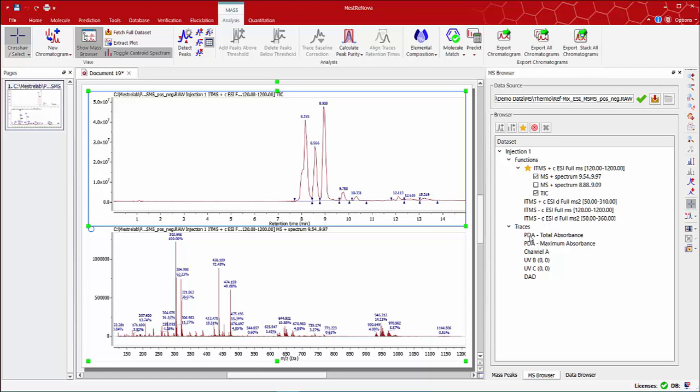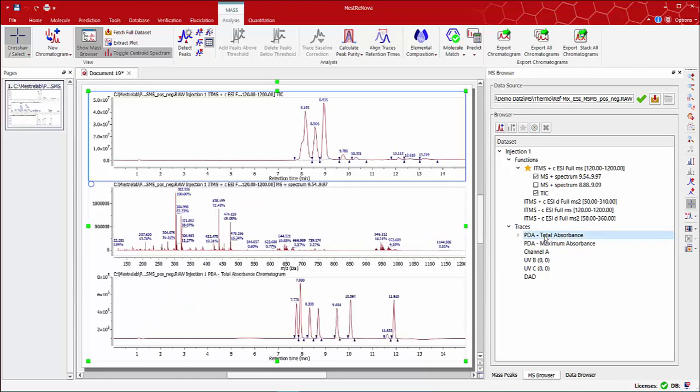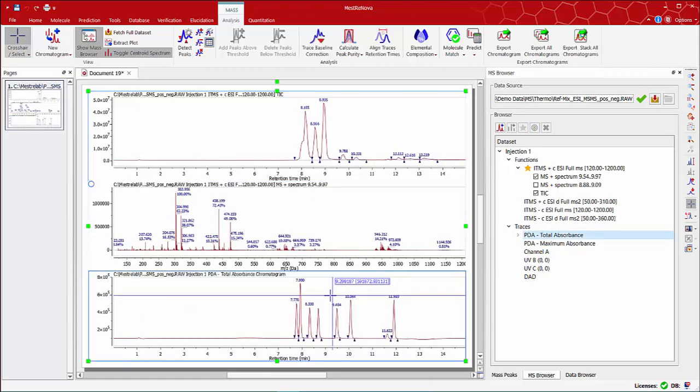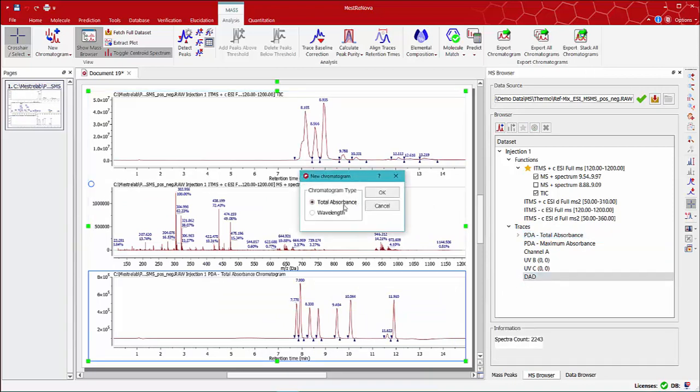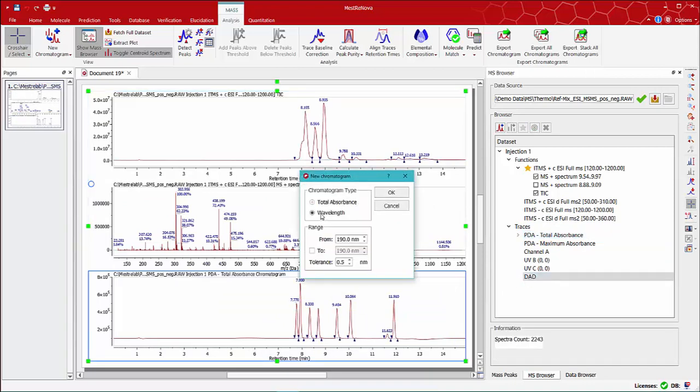In order to display the UV traces, just double click on any of them. If for instance you click on the DAD, a new window will appear.